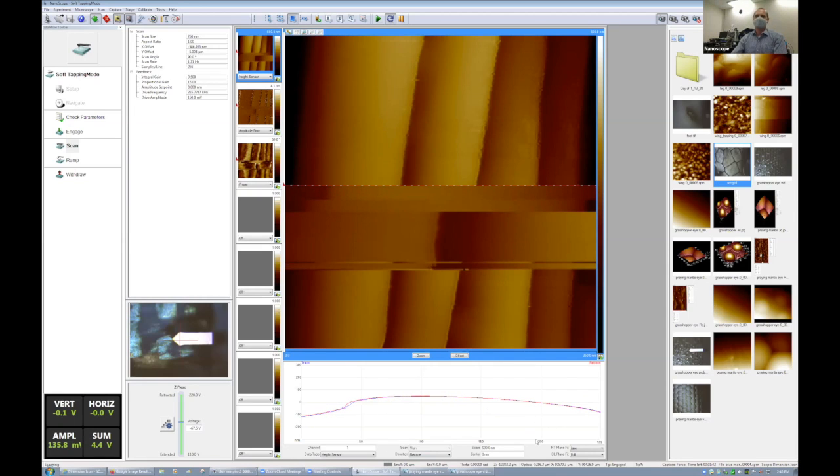Dustin has a quick question. Are you rendering a higher zoom picture now? I'm trying, yeah. I've gone down to 250 nanometers. I'm trying to see if I can get any roughness, any texture out of it. So I will share those images with you guys too, so you can grab them and take a look. I'll also share the bug pictures too.